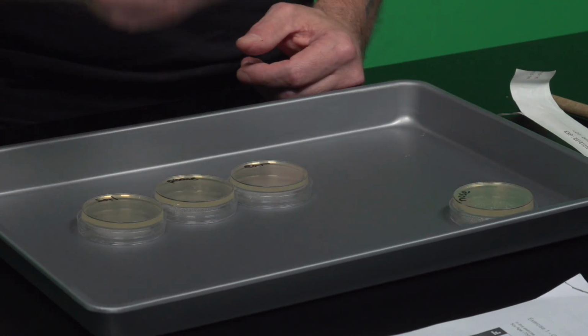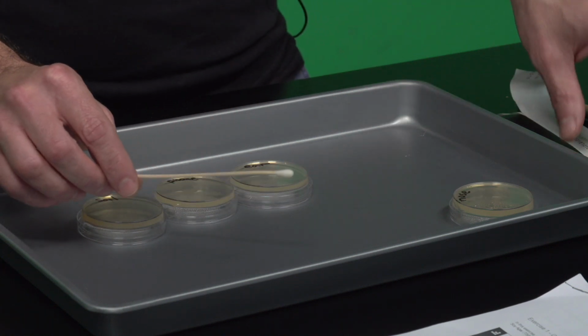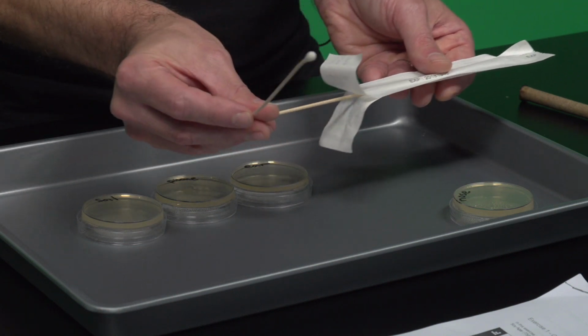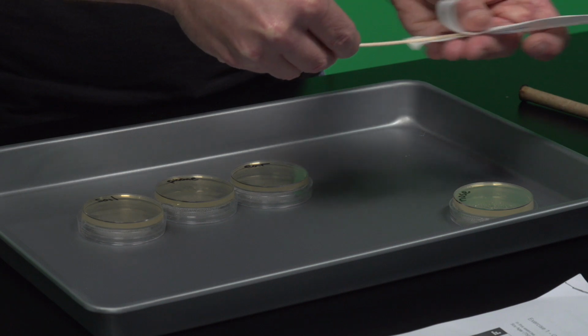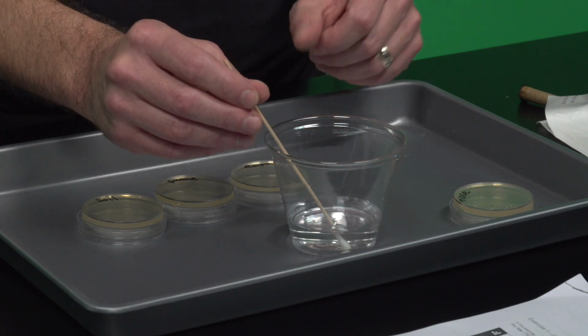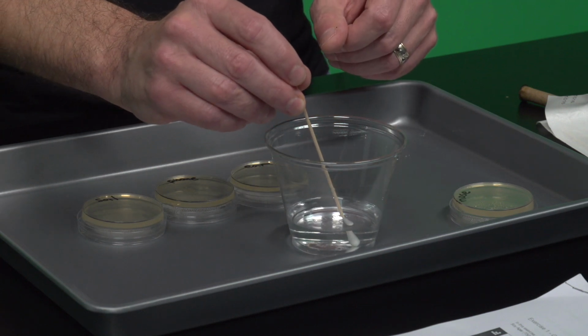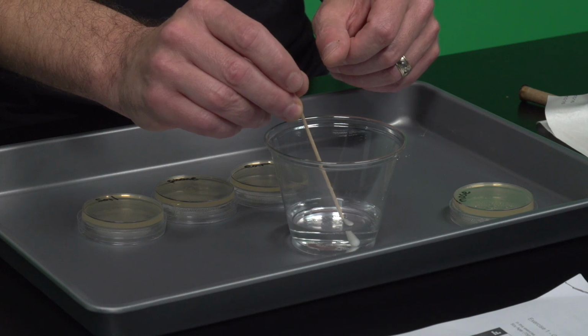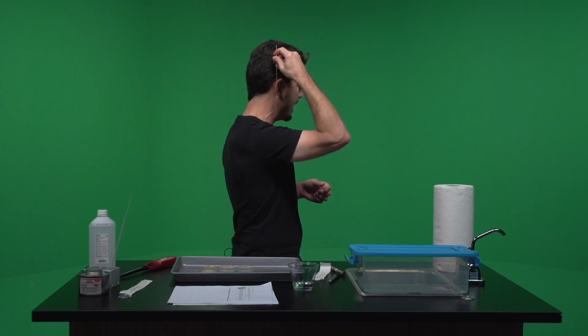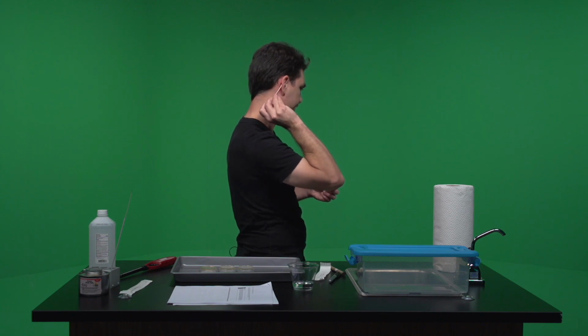And now what do we do with this swab? Okay, well, the first thing that we're going to do with this swab is I'm going to go ahead and swap out. I'm going to pull out the next one and put this back in there. So we don't have to worry about this swab quite yet. Okay, and so then for the ear, I'm going to go ahead and again moisten the swab. And then for my ear, I'm going to sample behind the ear, right? And so I'm twirling it around, whatever wonderful microbes are growing back there, I want, okay?